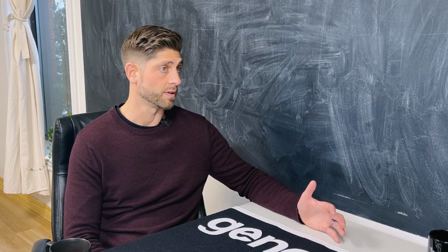And really, a lot of the time when you're processing a new crude, there's a lot to be learned. One of the things we'll often do is boil all of the solvent off of a big batch to know exactly how much crude is in the vessel, and then we'll redilute it so that we have more certainty around our ratios. It sounds like you're getting to know the properties of the concentrate you're working with, and it could be different from different growers, or different lots. It's different every time, really.